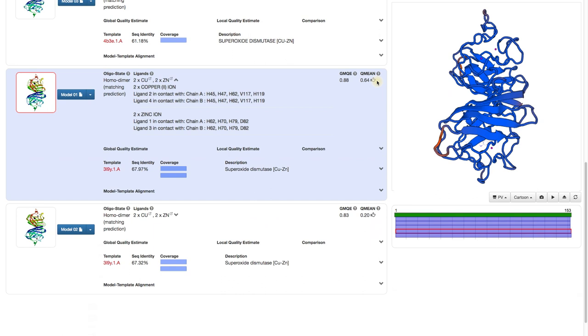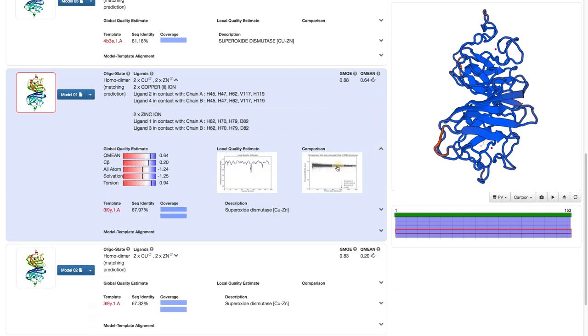Swiss model uses the Q-mean score for quality estimation. It is easiest to explain if we click here to extend our view and have a look at this comparison plot.